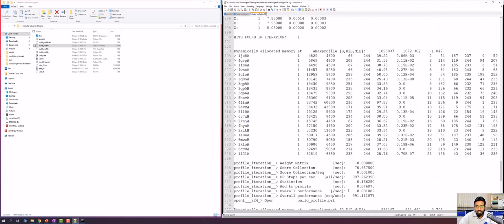The area of interest here is this region, which is very important, as I discussed in my previous session. These are the templates identified in this step. These are the sequences in the PDB95 file which are highly similar to the target sequence SDIA. These are the PDB entries having very close sequence identity with SDIA. As I said, this column is very important and this column is very important.